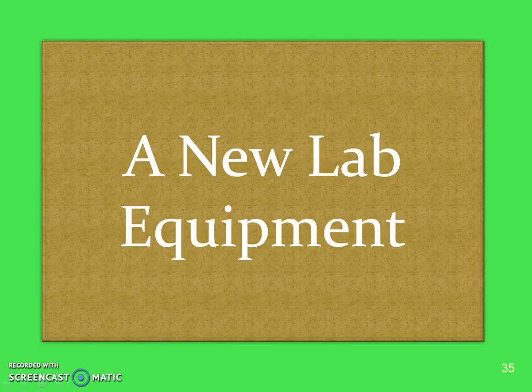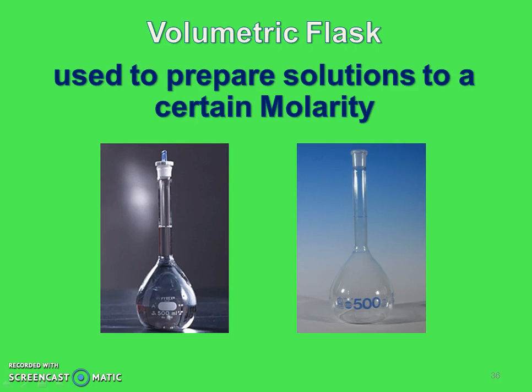So one new lab equipment that you need to know about is called the volumetric flask. Again, pause the video and write in that definition. The volumetric flask is something I need to go over because it is part of the AP exam. Lots of FRQs have brought up this volumetric flask, and the main use of it is to prepare a solution to a certain molarity.